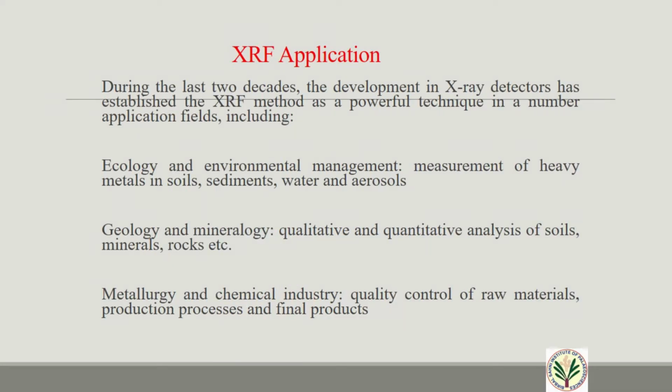Now we come to XRF applications. During the last two decades, developments in X-ray detectors have established XRF methods as a powerful technique in a number of application fields, including ecology, environmental management, and measurement of heavy metals in soil, sediments, water and aerosols. We can also apply it in geology and mineralogy, for quantitative and qualitative analysis of soil, minerals and rocks.